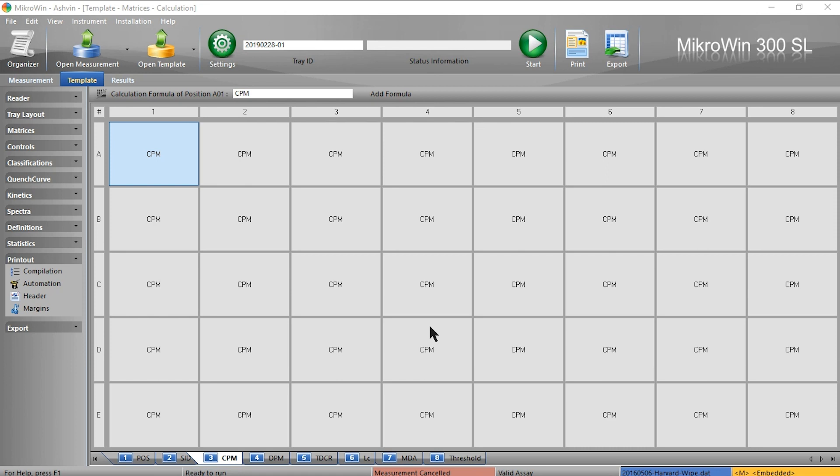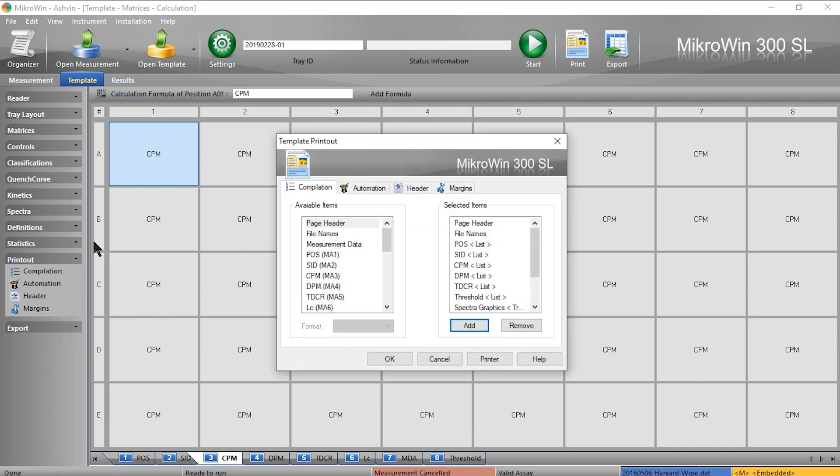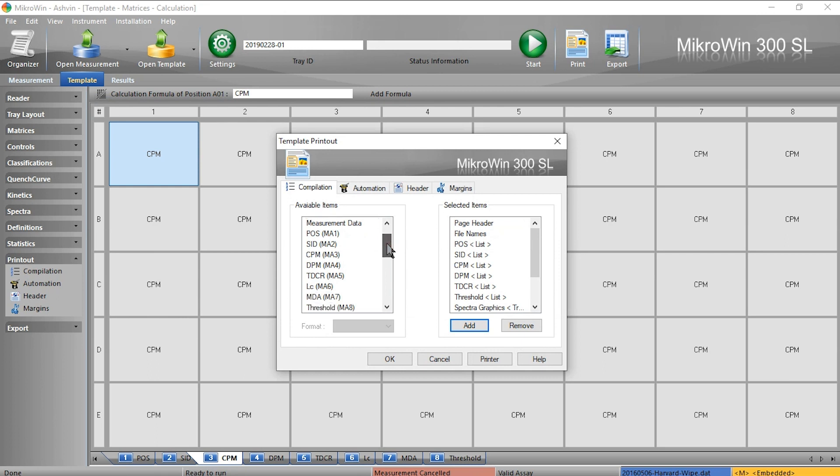We can select this option by going to template printout compilation. In compilation I can select which data I want to print out. The left hand side is all of the available calculated data that we have in our tabs or matrices, and on the right hand side is just what I currently have selected to print out.